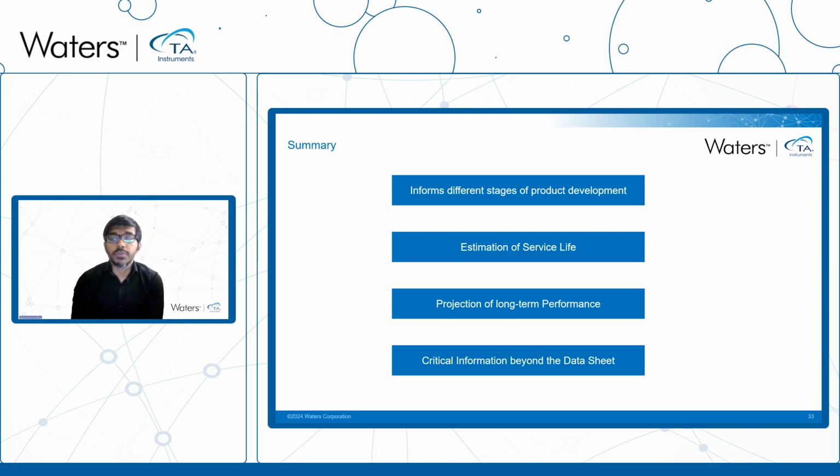And finally, the material properties indicated on a material data sheet are determined under ideal conditions and do not represent the actual properties of the molded parts. The datasheet is also limited in terms of providing information for specific environmental conditions. It is important to understand the actual characteristics of the molded parts in order to avoid degraded performance and or premature failure. And the monotonic, fatigue, and DMA tests demonstrated in this analysis each revealed unique and critical information to understand the material response under the required service conditions.